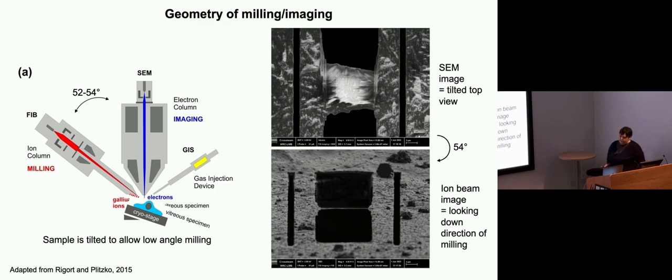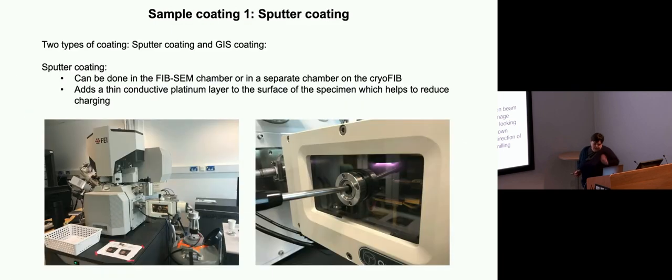And then the ion beam view, this is looking down the direction of the milling. So you'll be milling into the screen. This is the lamella side on. This here is this front edge and this stepped profile that you can see here. You can see in these steps here.